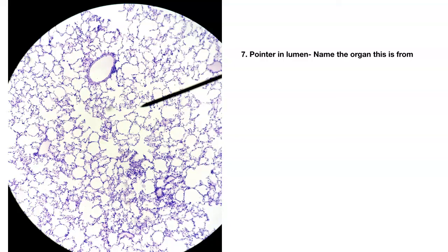Number seven — what organ is this from? Nothing else looks like this. These are little alveoli where we have gas exchange — we have millions of them. This is the lung. I just asked which organ this was — the answer is the lungs. But this is all simple squamous.